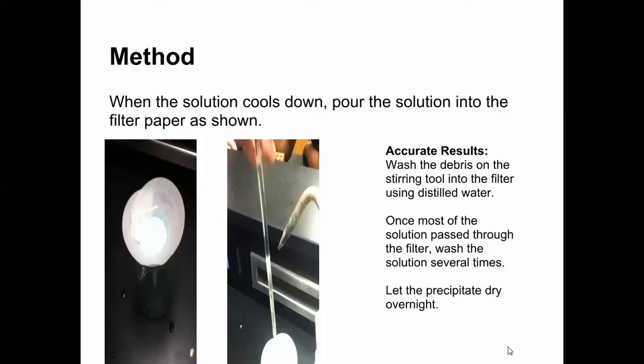This makes the amount of nitric acid and salt used obsolete because both compounds are soluble and will wash down the filter along with the water. Washing the precipitate is highly suggested so that most of the soluble ions are filtered through. Let the precipitate dry after filtering.